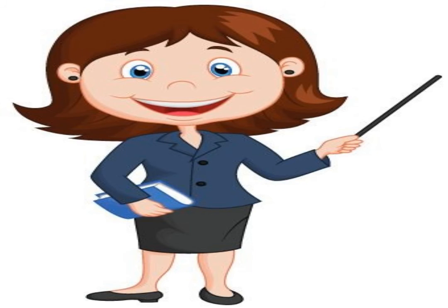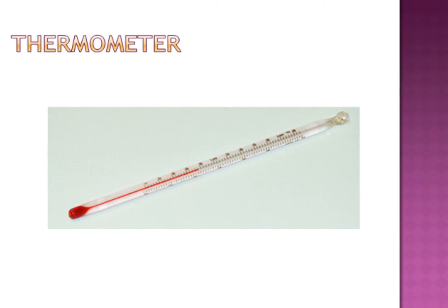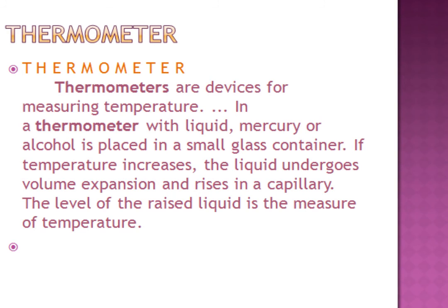We've nearly reached the end of today's video, but before ending, we have one last apparatus left. So let's see what it is. It's a thermometer. Spelling time: T-H-E-R-M-O-M-E-T-E-R.